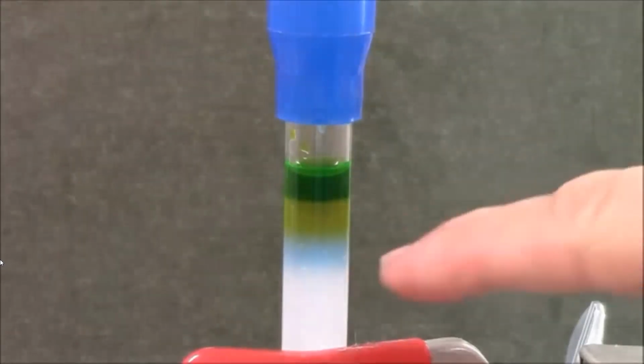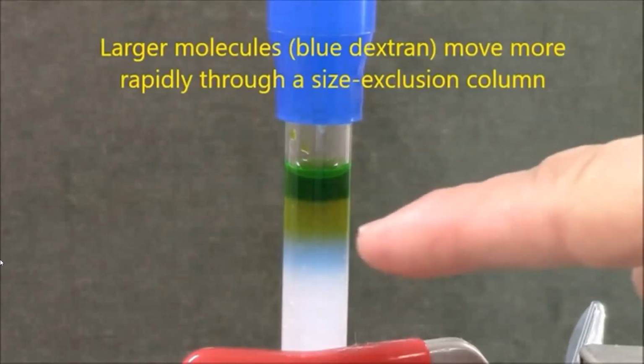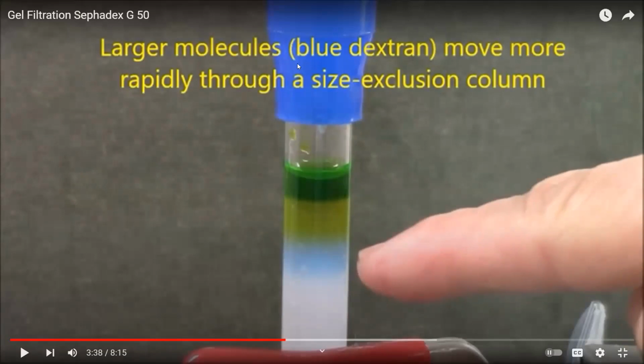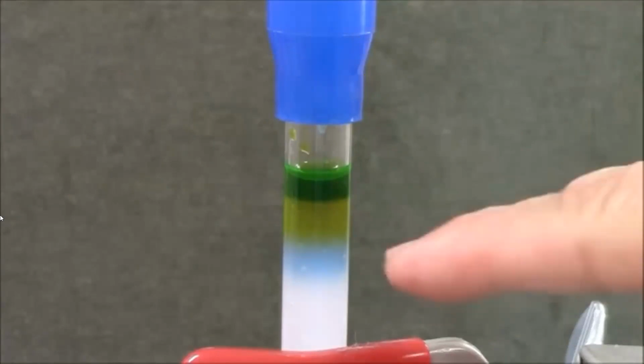So here you can see the blue molecules, the large molecules, are moving faster through the gel. Yeah, so the larger molecules are of blue dextran. Now, because of the beads, the larger molecules could not enter inside the beads. So now they are making their way through the void volume, okay, through the voids between the two beads. So the interspaces. A complete separation between the blue and the yellow.